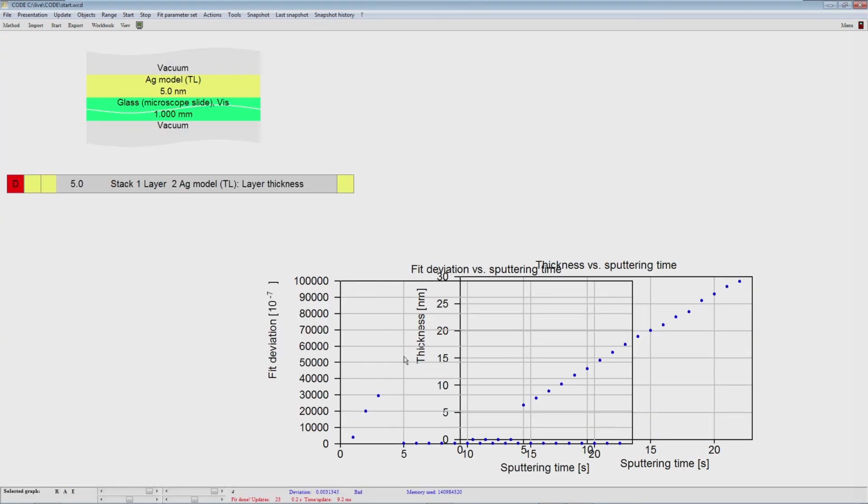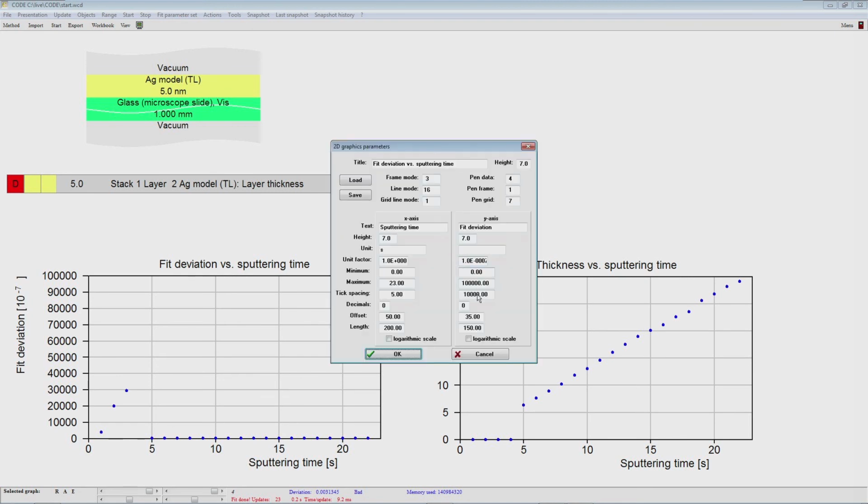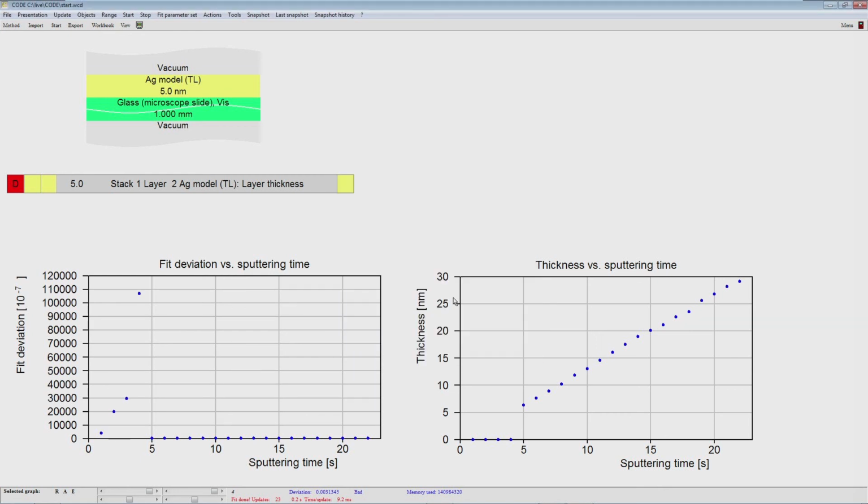So we can now see a graph like this. Actually, the biggest one here is even higher. So I have to go to, I guess, 120,000. Yeah. So now we see, okay, the first 4 fits are really bad, and the others are okay. They have a very, very small fit deviation compared to the first. So let's now improve the fit.